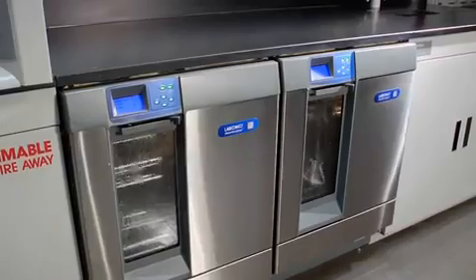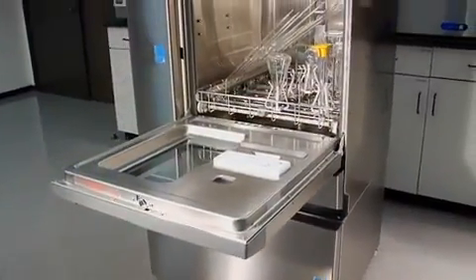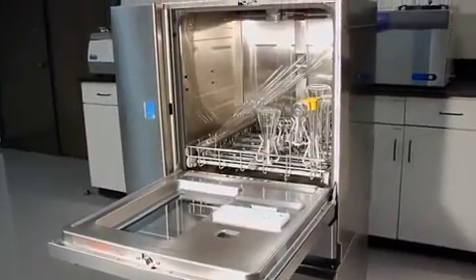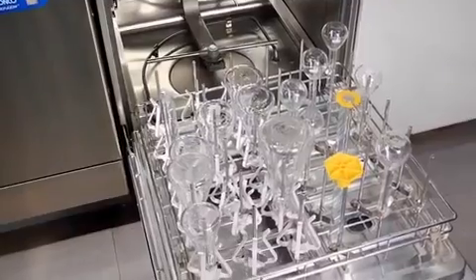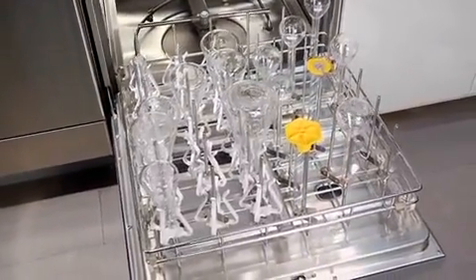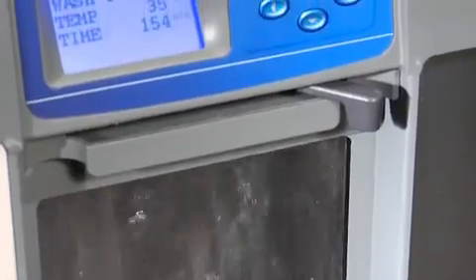Built-in options are offered on selected models. High heat programs on 230-volt models reach 199 degrees Fahrenheit to sanitize glassware and effectively remove lipids, tars, and waxes. A viewing window with an interior light lets you see cycles in progress. This feature comes standard on the Flask Scrubber Vantage series and is optional on the Steam Scrubber and Flask Scrubber models.